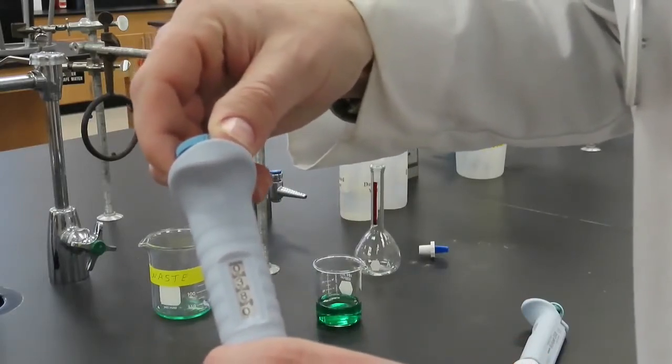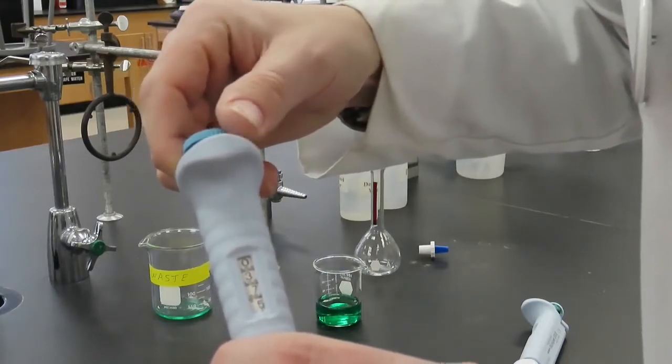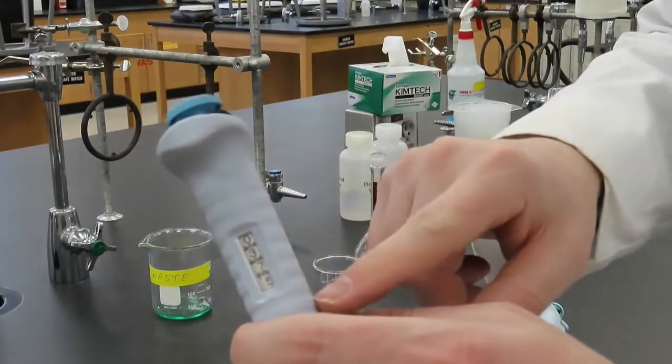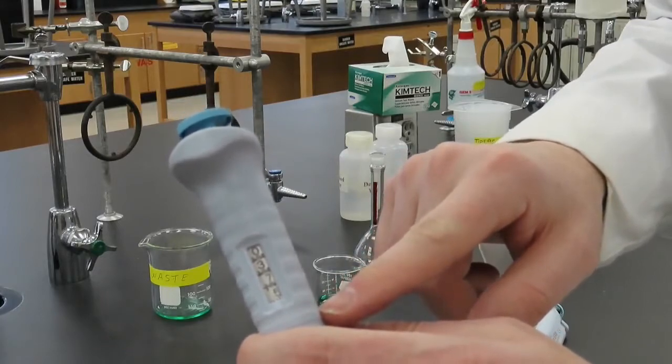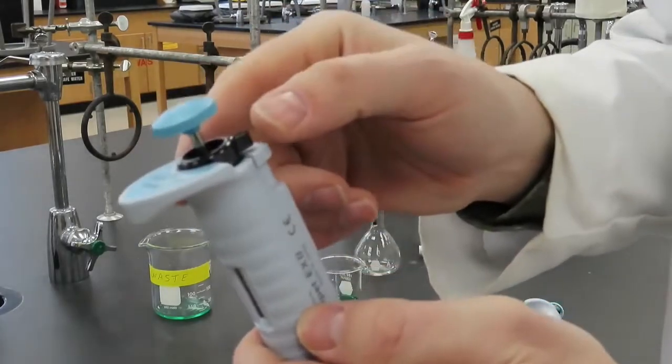Finally, we set it at 376 microliters. If this is the volume we want, we then lock the volume locking ring and continue.